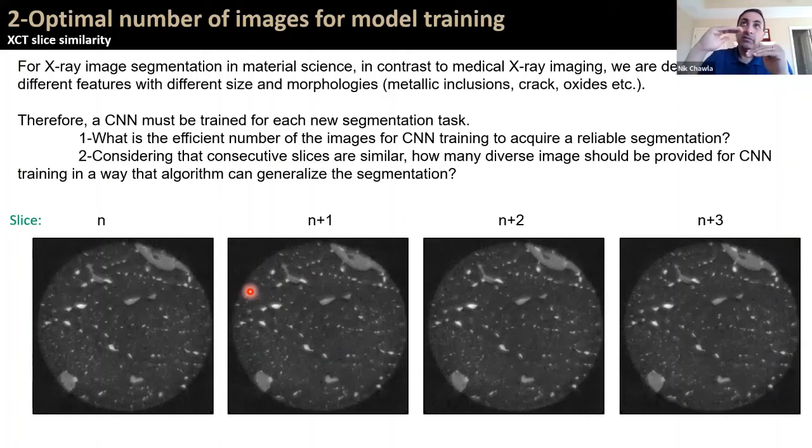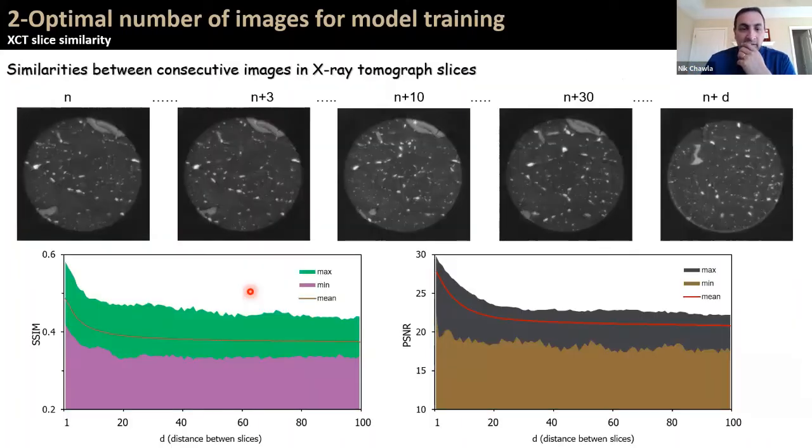And when we think about tomography data, and when we reslice this data, we need to also think about the differences in the images. And are we using the most contrasting images in terms of microstructural features? So here we did a very simple example where we took all the slices, we resliced the data set, and we started looking at slices that were 1 slice apart, 2 slices apart, 10 slices apart. And we realized that there is actually a nice threshold there where some of these slices are actually quite redundant because they're very closely spaced.